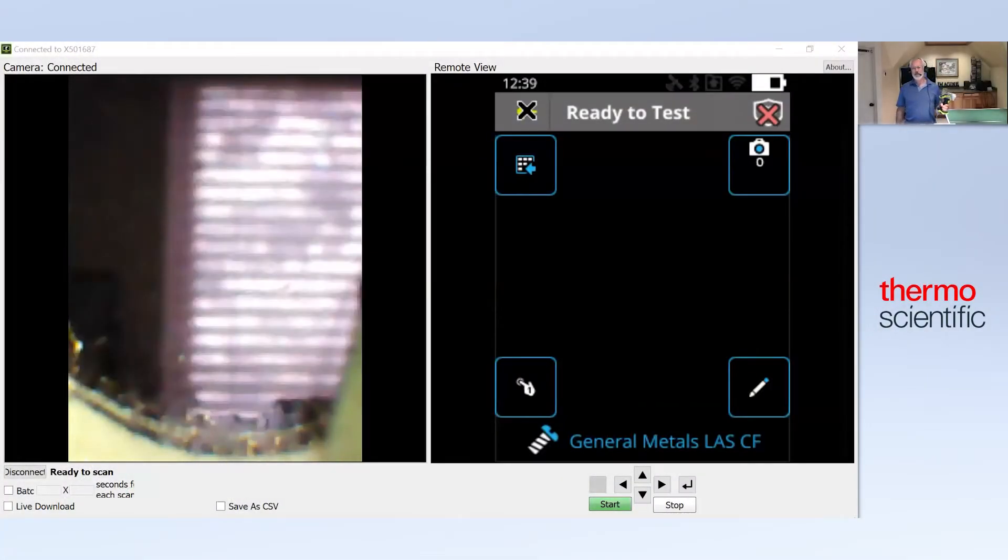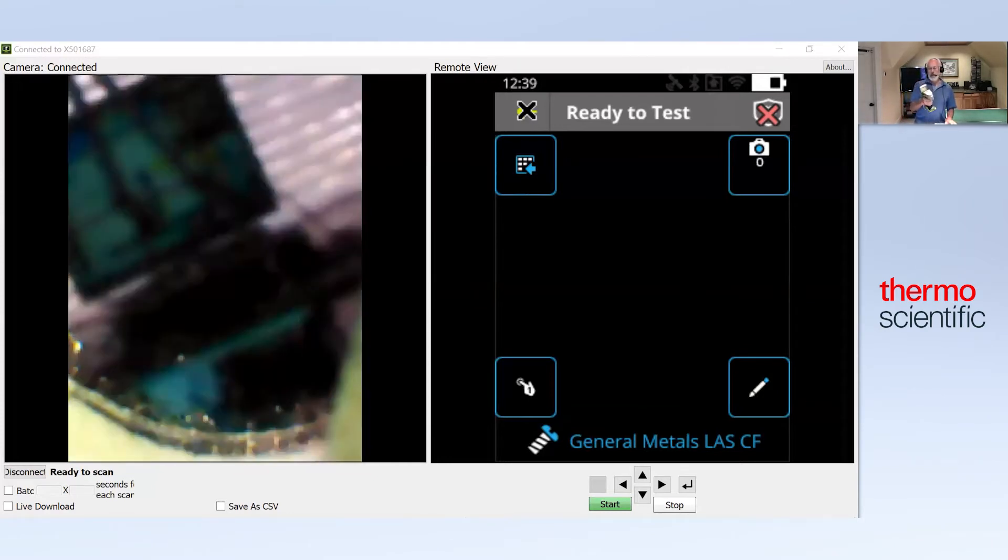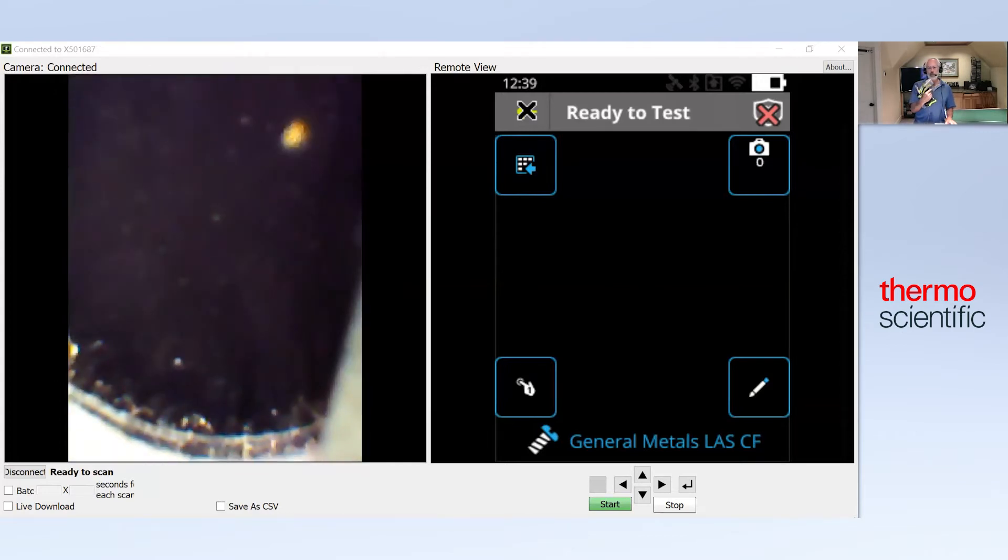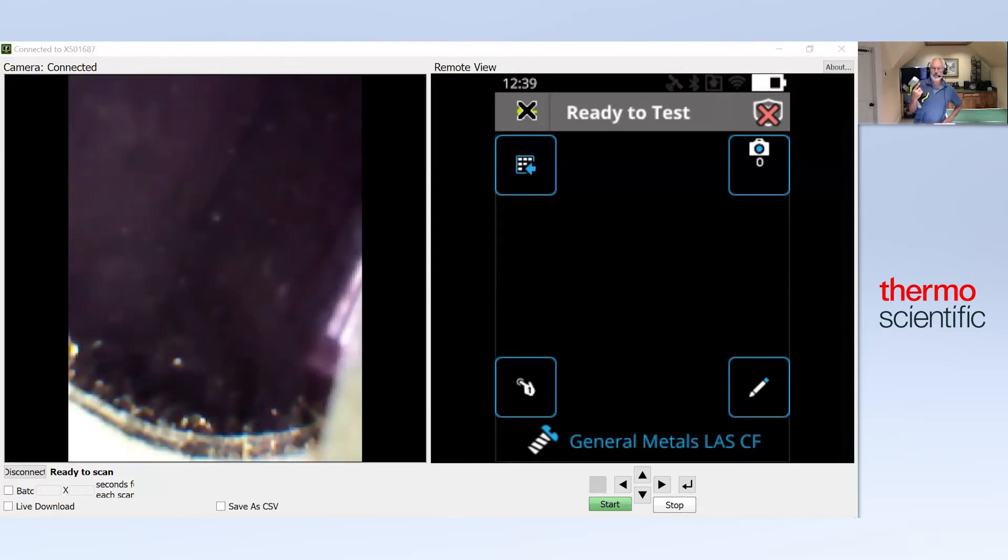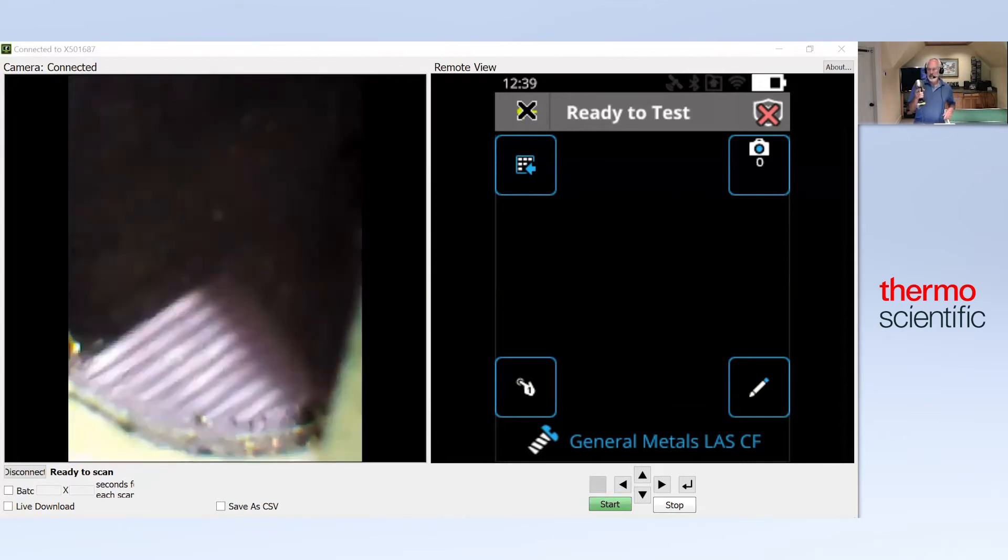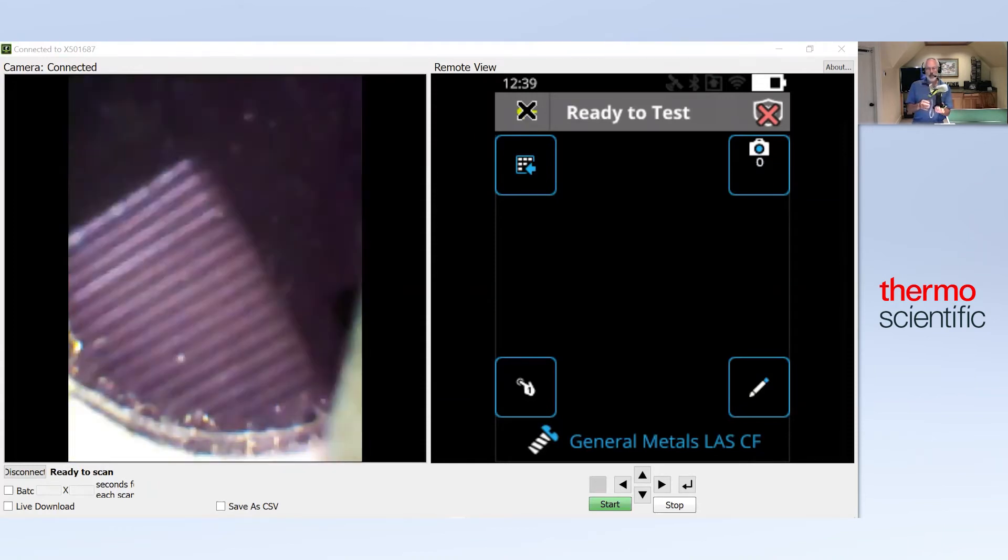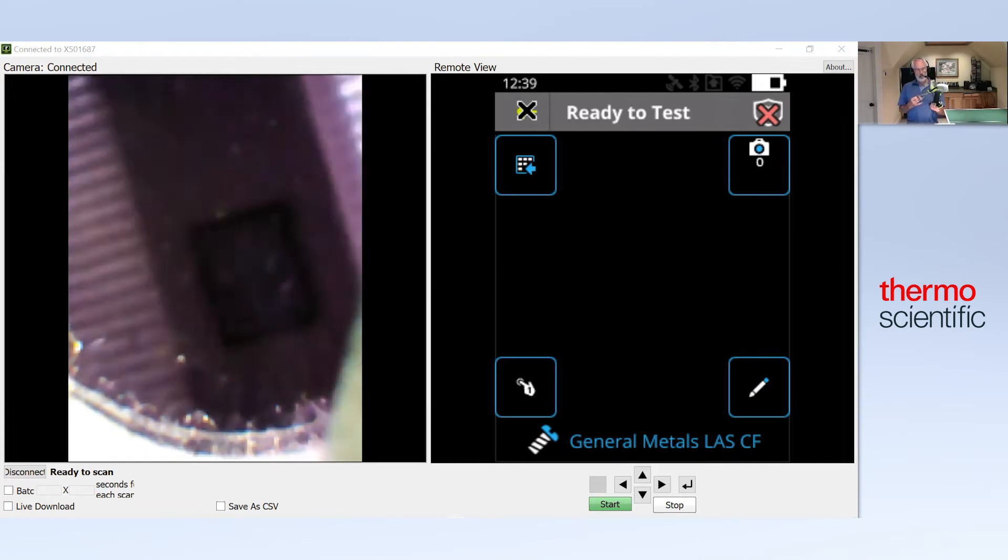Hi, I'm Jim Pazmore with Analytical Services and Testing, and today I'm going to give you a demonstration of this new Niton XL5 Plus from Thermo Fisher Scientific. This is the smallest, lightest, fastest, and most accurate analyzer I've ever used in x-ray fluorescence. I compare it to a cross between a Porsche 911 and a Land Rover Defender because of its speed and size, and yet it's extremely rugged, a nice metal case, and it looks industrial even though it's elegant in its design.